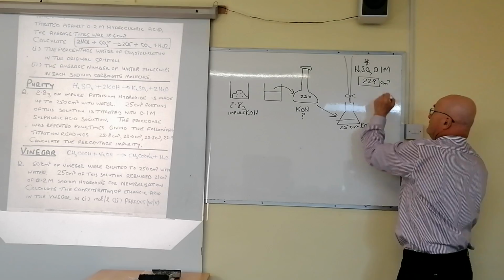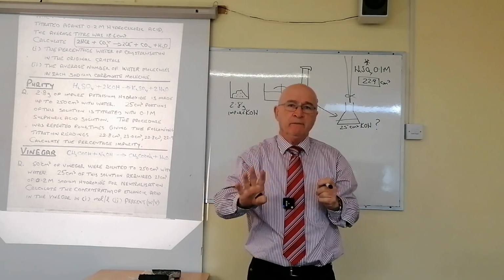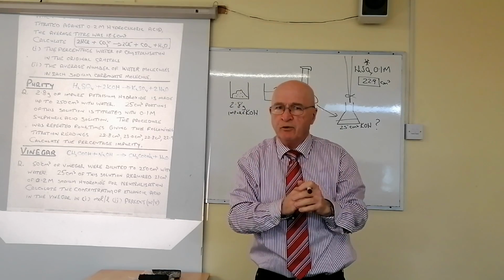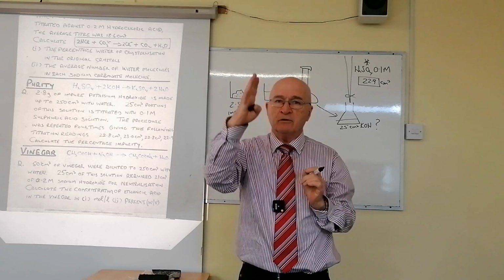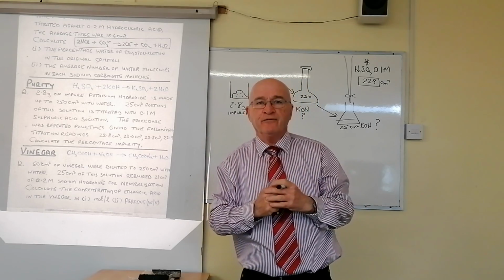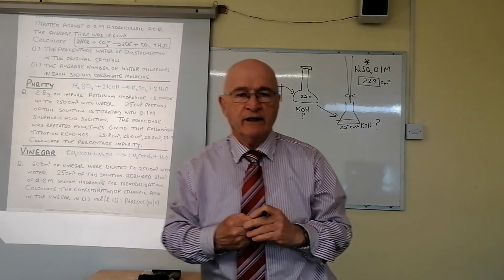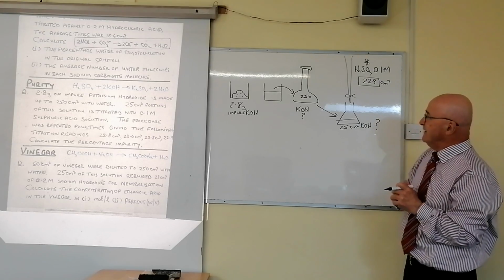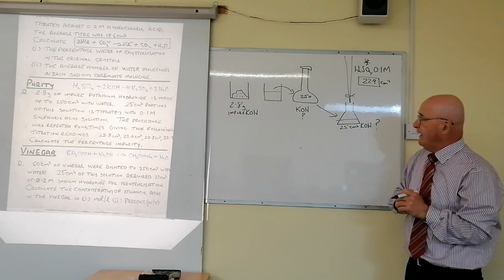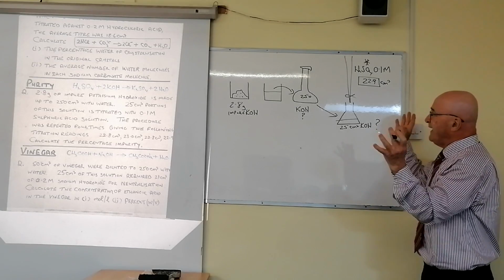Okay, I'm repeating that again for you now. You always eliminate the first reading because you're working blind. You don't know quite where the end point will be. Once you've got the first end point, then the next time you run the titration, you can be far more cautious and they're likely to be far more accurate. And that's very important just in what you would be doing there, right? Now, that's very important that you're able to see that and you're able to work your way through that. I hope it's okay. Now, I have nearly everything I want here for the moment. Nobody asked me any questions.